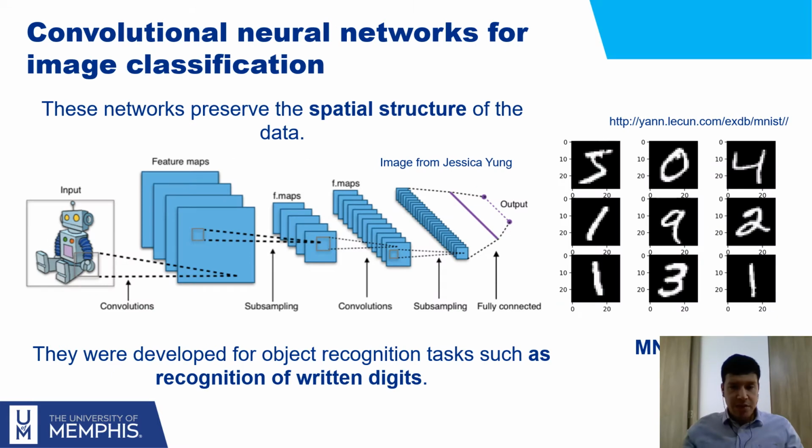So, as I just mentioned, the main feature of these models is that they preserve the spatial structure of the data. That is, if we have an image, for example, these layers can isolate or abstract the spatial details that are characteristic of the given object to be detected. And by doing this in a stage-by-stage fashion, the really useful information of the input set of images is abstracted, is somehow summarized.